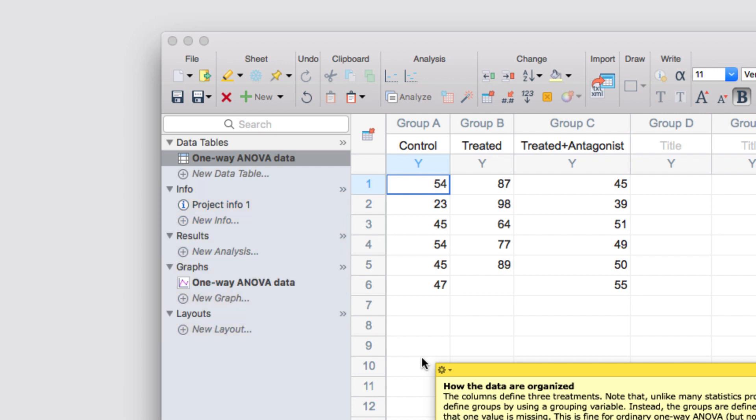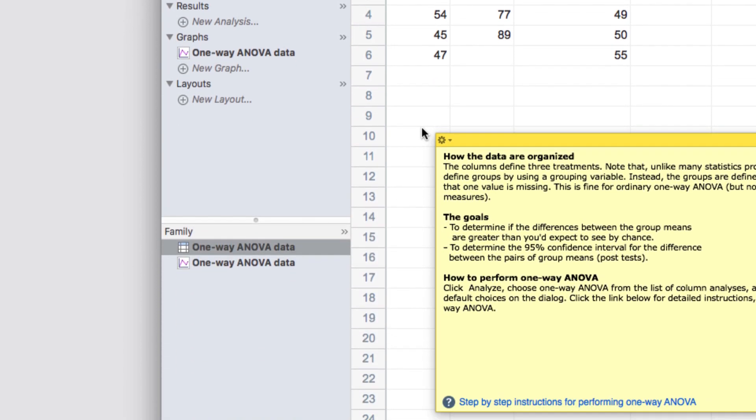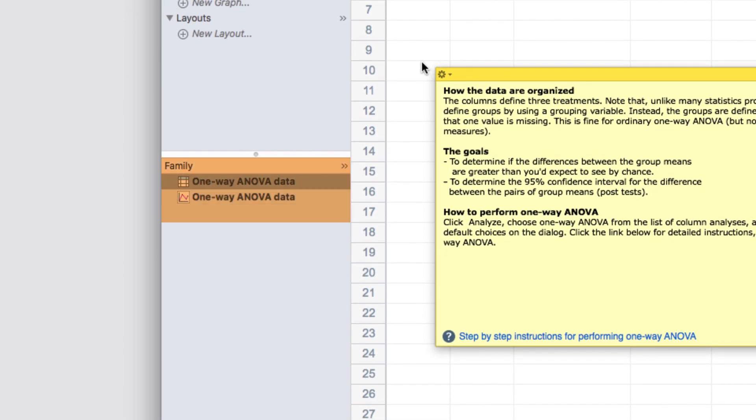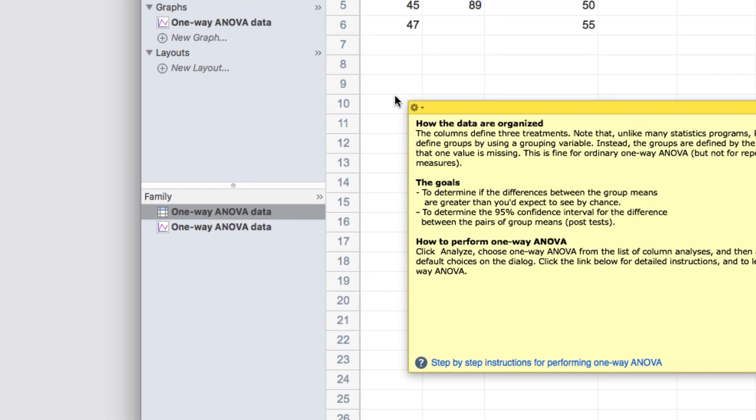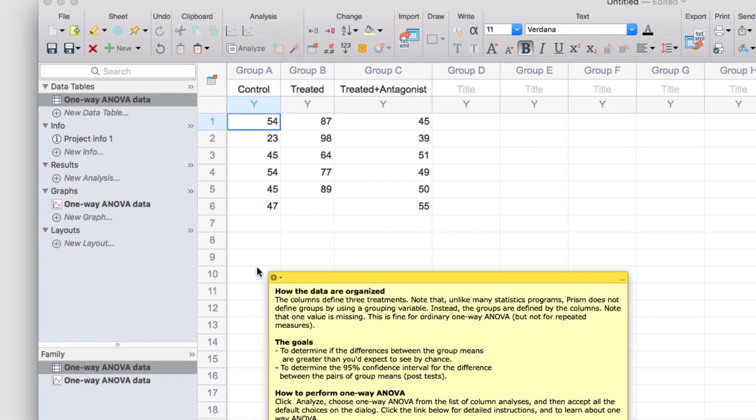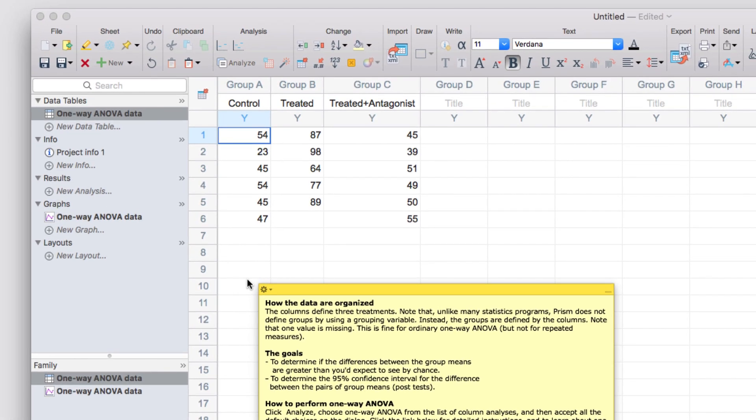And within each of these sections, you can organize the order of the sheets simply by clicking and dragging. It's worth noting that any sheet that is linked to the actively selected sheet, such as graphs or analysis results generated from a data table, will appear bold in the Navigator panel. Below the Navigator is the Family panel. This provides another way of viewing linked sheets. Only sheets that are linked to the sheet that's currently selected in the Navigator will be shown in the Family panel, and this panel will update when you select new sheets in the Navigator. So that's the basic layout of a Prism project file.